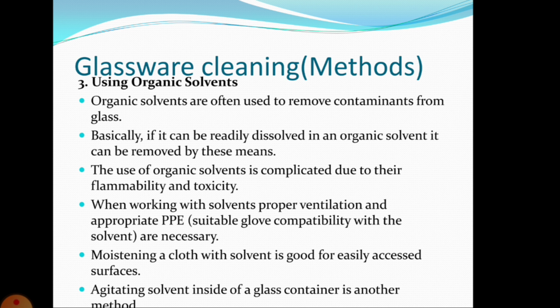Moistening a cloth with the solvent is good for easily accessible surfaces. Agitating solvent inside of the glass container is another method.